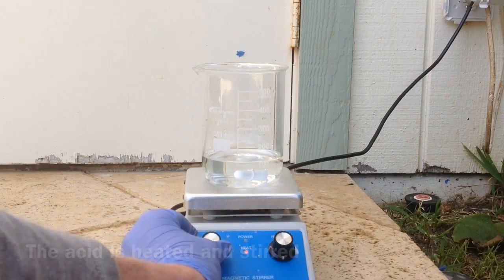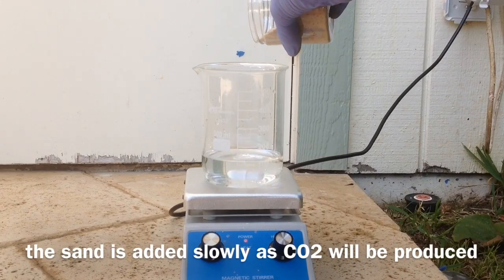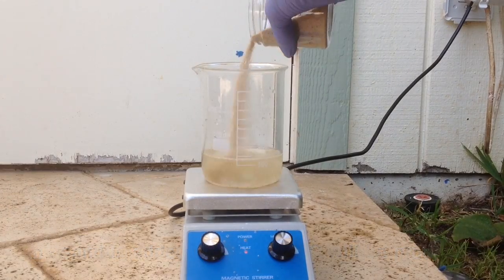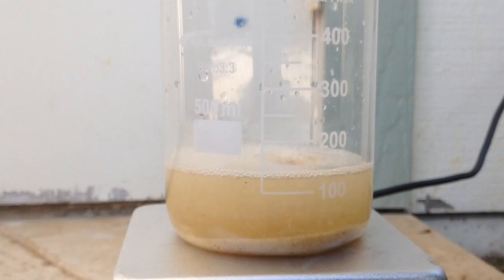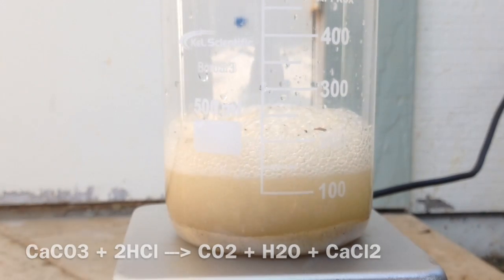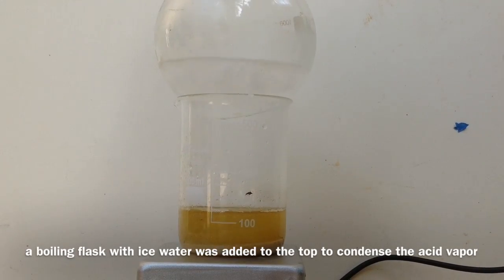One of the impurities is calcium carbonate, which will produce carbon dioxide gas, so you want to add the sand slowly. We also add a boiling flask to condense the HCl vapors.